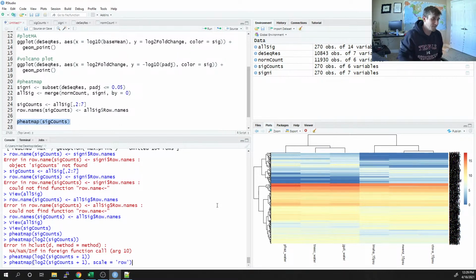It's going to find the mean, and it's going to find the distribution, so you more or less have a standard error or a standard deviation. And so whenever we scale, instead of looking at the raw numbers, we're looking at where a data point falls in the distribution. We're going to use a standard deviation to do so. Hard to explain, much easier to visualize.